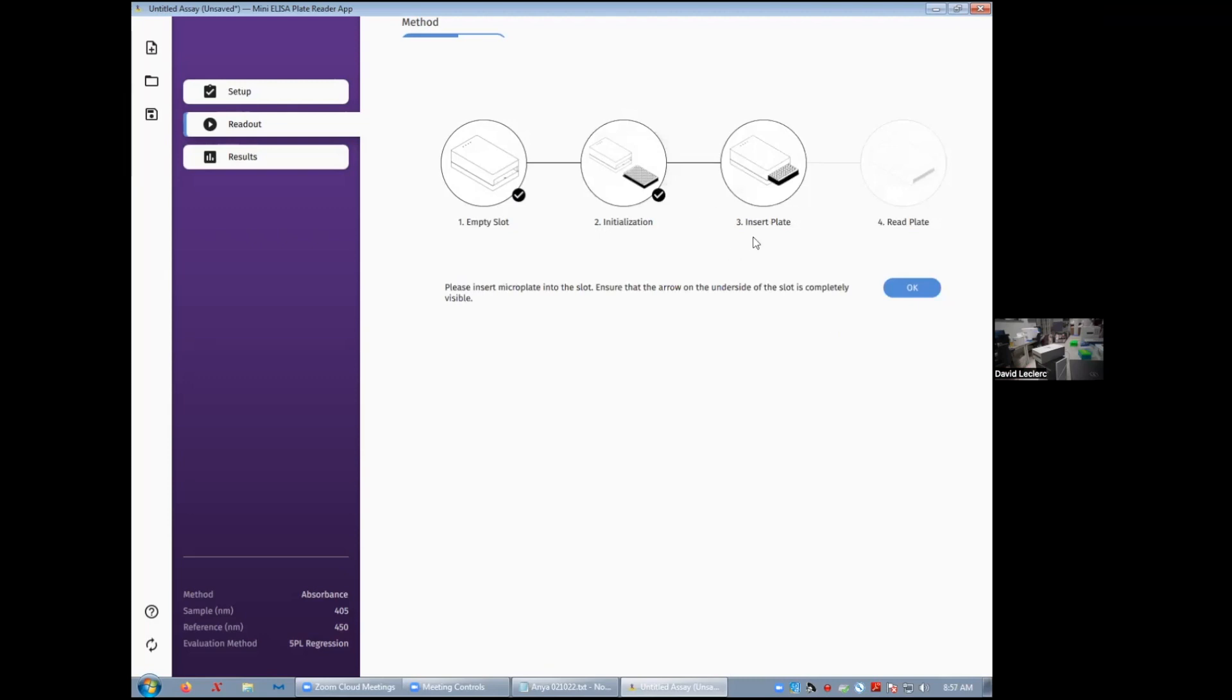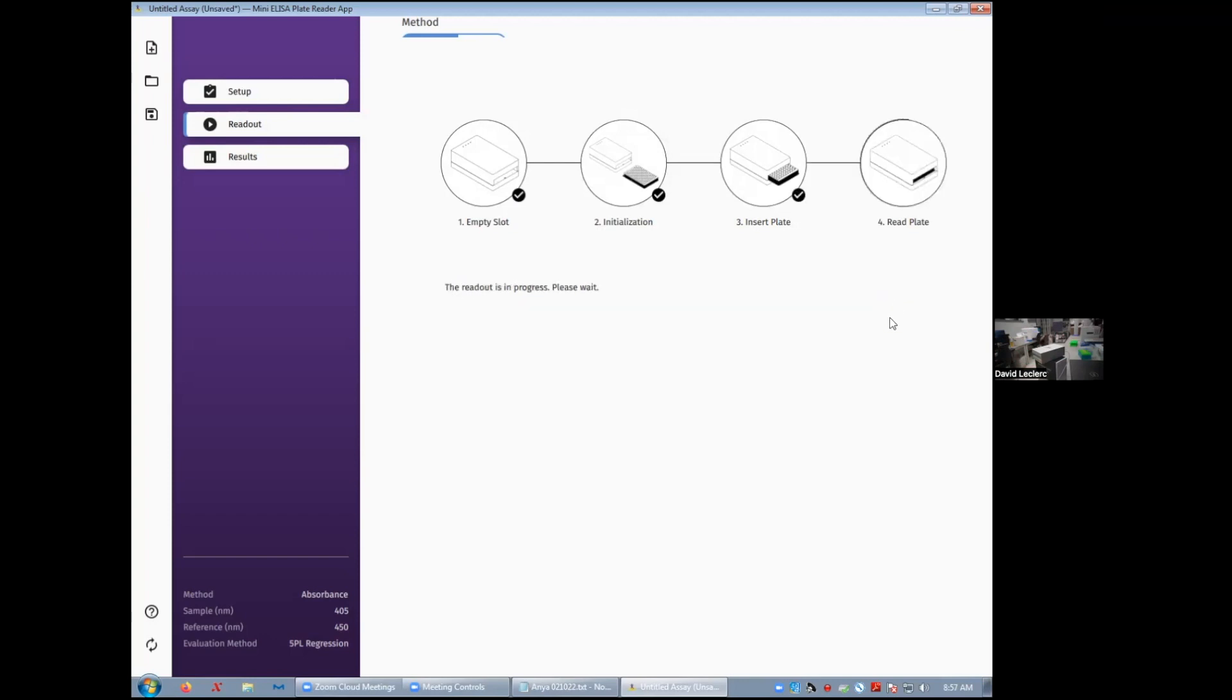When you get prompted, you can insert the plate. There's a little diagram on the instrument telling you what's the orientation of that plate. And then click OK. And the reading gets done.